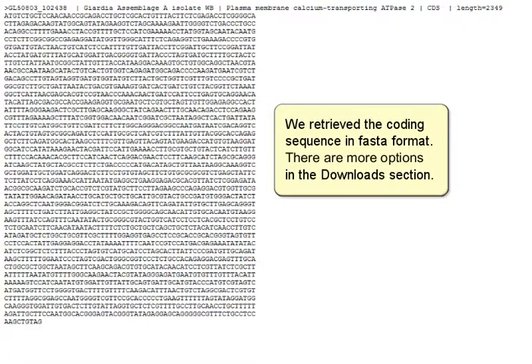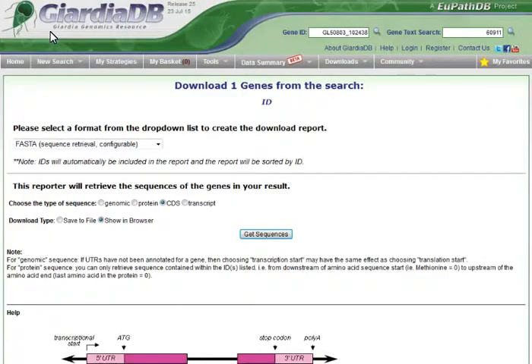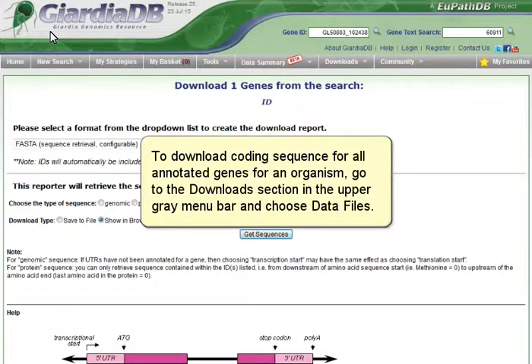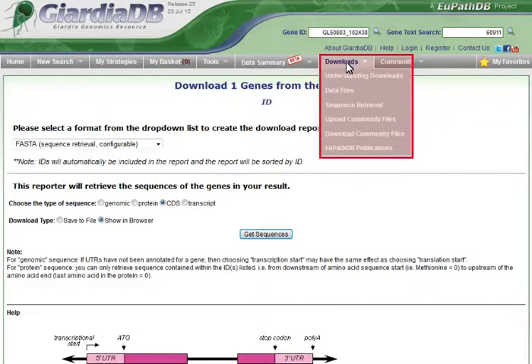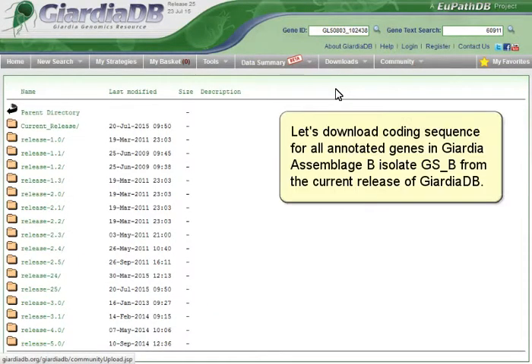There are more options in the Download section. To download coding sequence for all annotated genes for an organism, go to the Download section in the upper gray menu bar and choose Data Files. Let's download coding sequence for all annotated genes in Giardia Assemblage B Isolate GSB from the current release of GiardiaDB.